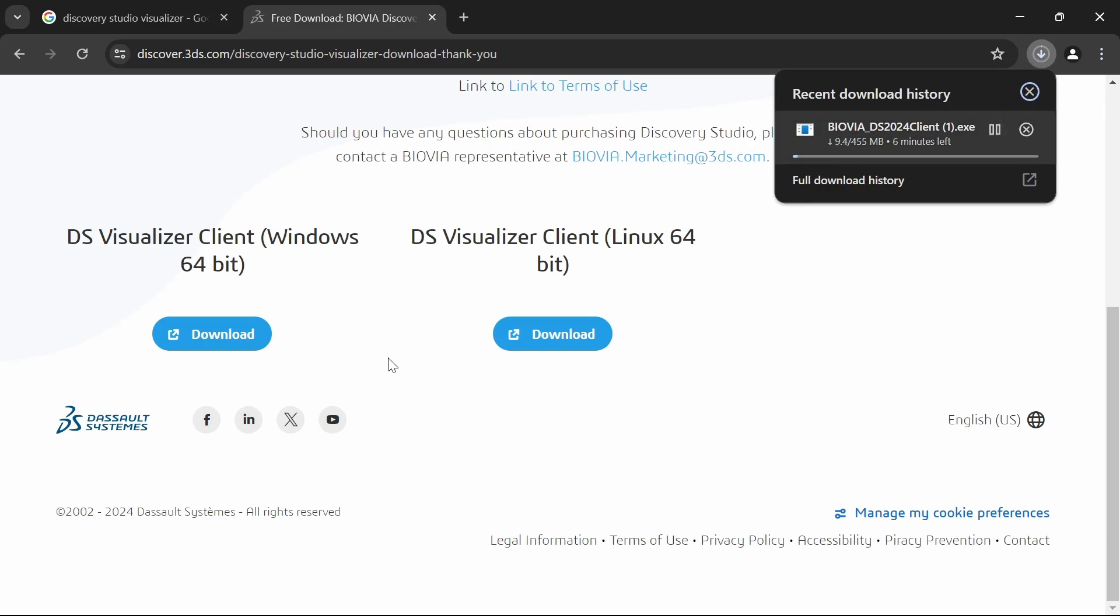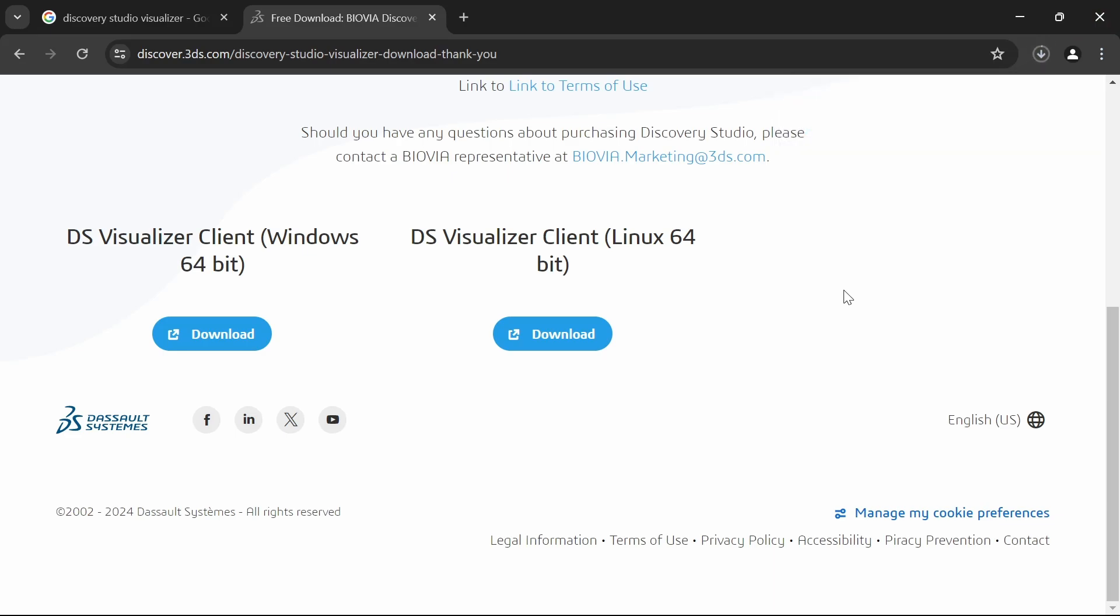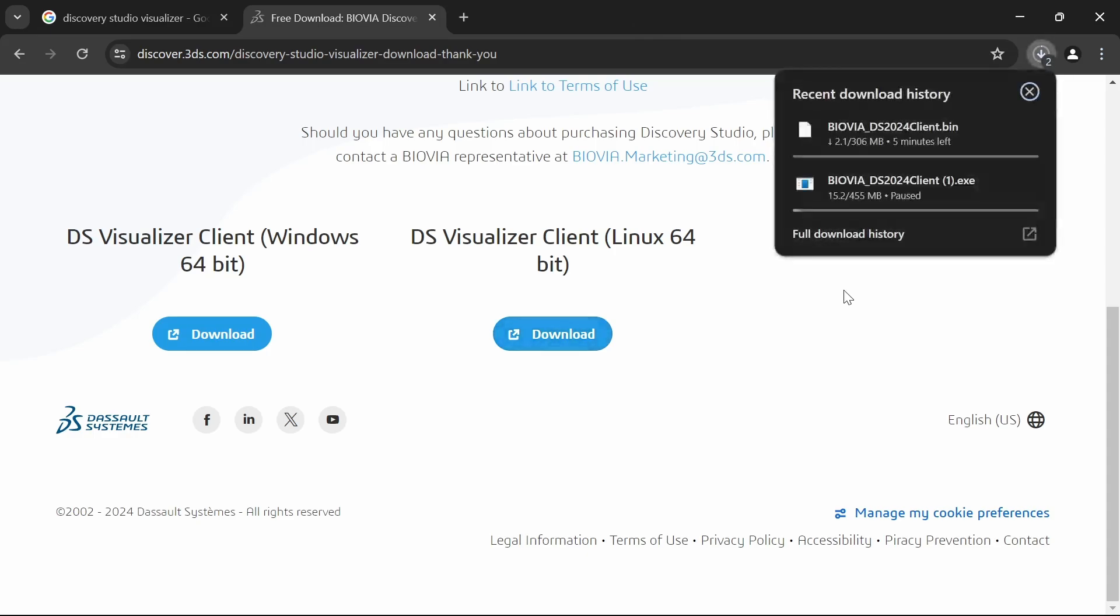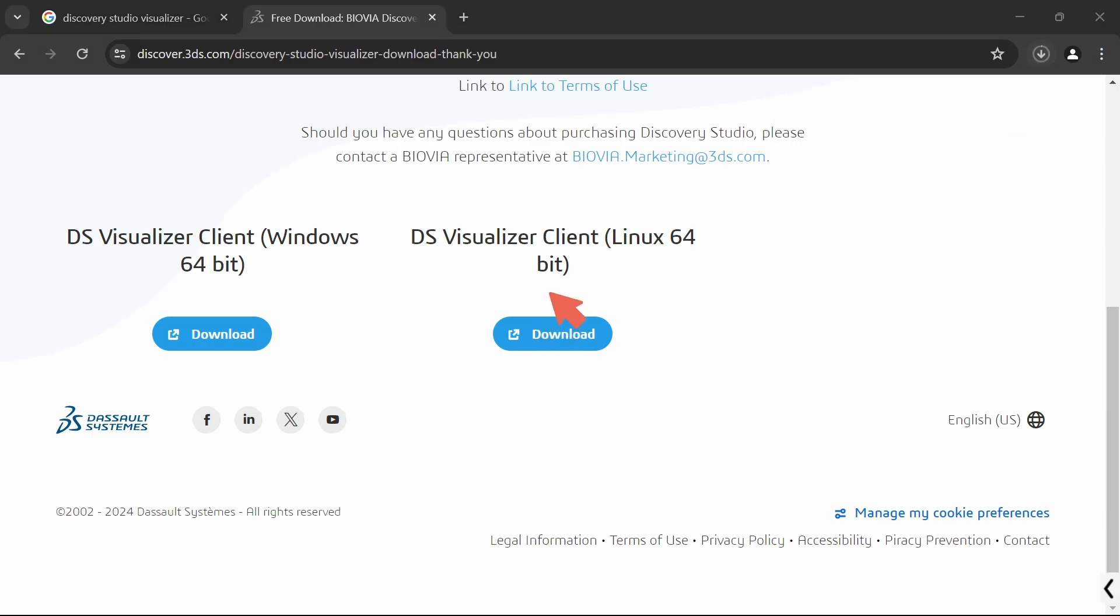This will be approximately around 500MB, 455MB. This is the executable file, exe file, and this is the Linux version. This is the bin file. So I have downloaded both versions.